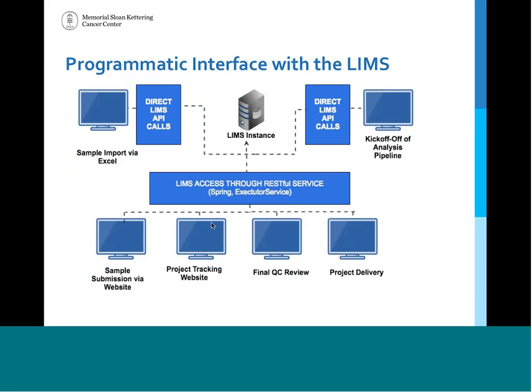So the next thing I'm going to discuss is the way that the LIMS interfaces with different other systems. I'm going to talk about this a little bit through the research first, and then mention some things about the way the clinical lab has their interface set up, and a little bit on how both systems utilize this final deposit called the cBio portal.